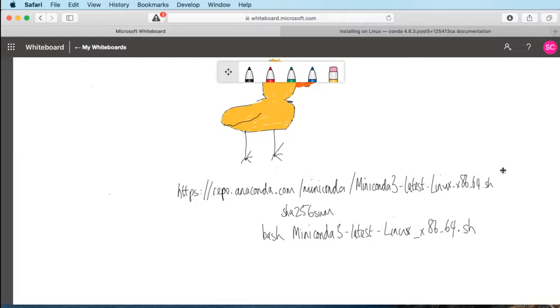The problem will come if any of the software that we're trying to download is distributed only as a 64-bit version and not as a 32-bit version. Maybe we can check that for some stuff later on. But otherwise, it might be worth investing some time and energy to try and get the 64-bit version installed. But if everything is distributed as both 32-bit and 64-bit, then actually it shouldn't really matter too much.